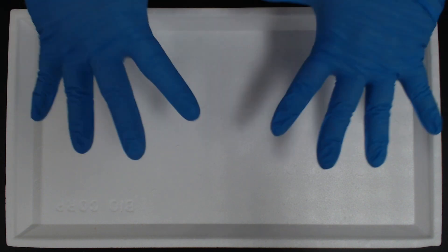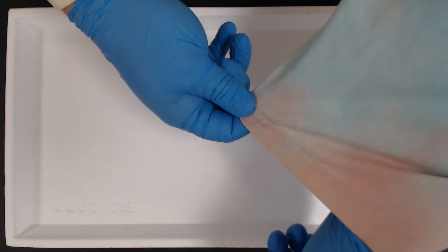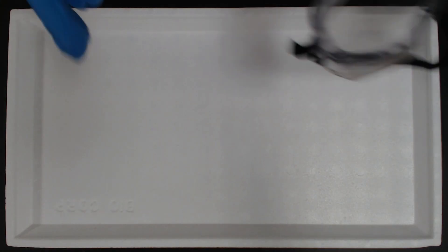Before we get started with our dissections, we need to make sure that we're safe. So make sure you have gloves, lab coats, and goggles.